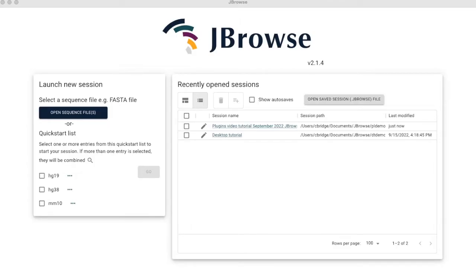We've reviewed how to access and install plugins and took a look at an exemplar plugin that makes use of several pluggable elements available through JBrowse. When considering plugins that may be useful to your workflows, make sure to read the corresponding documentation to observe what kind of pluggable elements, such as new widgets, data adapters, and authentication systems, are available to you. Whether you're a user or a developer, it's important to keep in mind the variety of toolsets that JBrowse permits plugins to expand upon, such that you're taking full advantage of what's available.